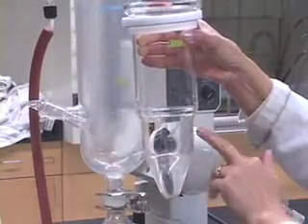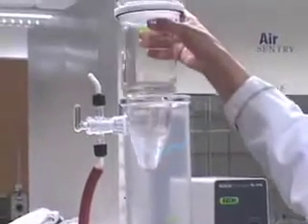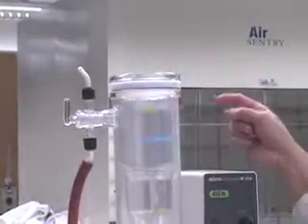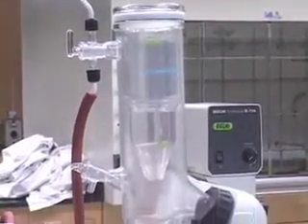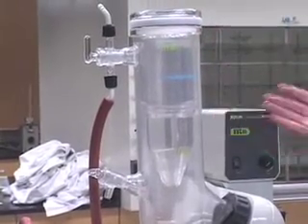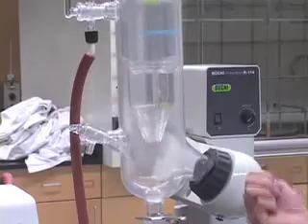What have I taken? I have taken isopropanol inside here. So, you take isopropanol in that condenser and then you are going to add dry ice into this isopropanol to prepare a cold mixture. So, the cold finger now is really cold when you add dry ice, and the evaporating solvent, when it comes into contact with that cold surface, will condense back into the liquid form.